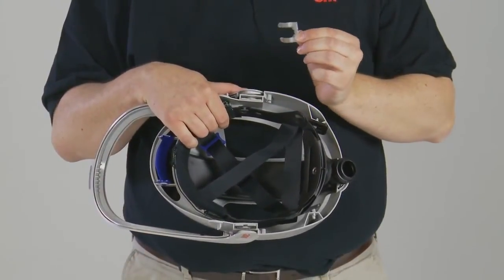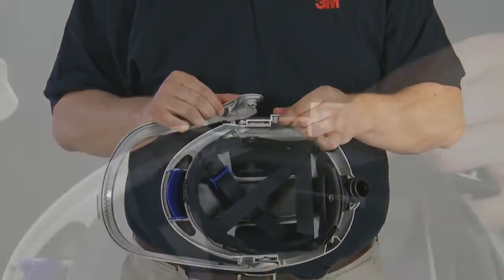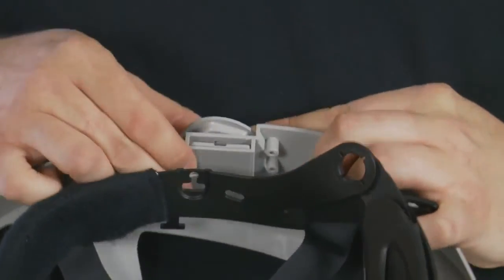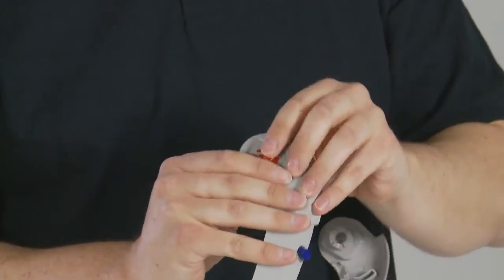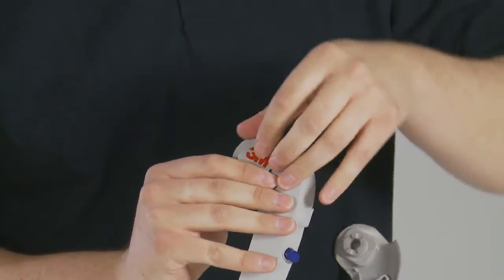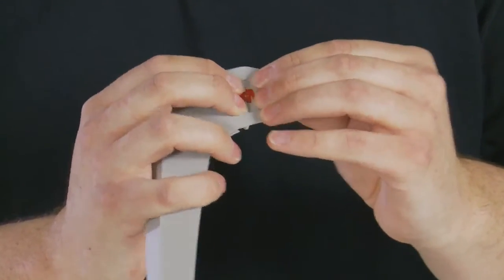The visor frame can also be removed by removing the tension clips on either side of the head top. To replace the visor frame, align each side with the cams in the head top and reinsert the clip to hold in place. The pivots mounted in the visor frame can also be removed simply by pushing outwards from the inside and can be replaced by simply pushing back in until secured in place.